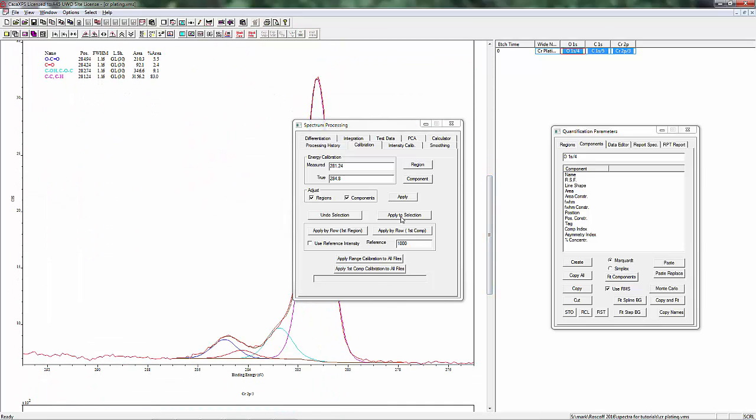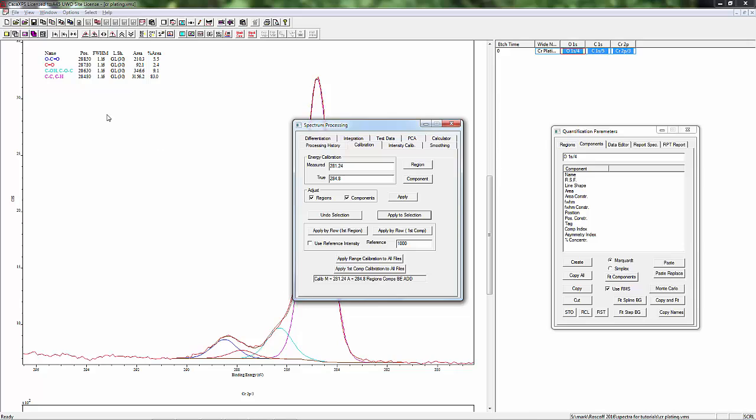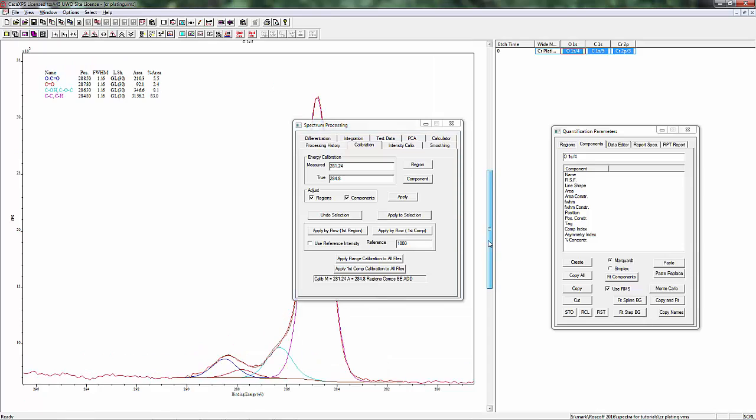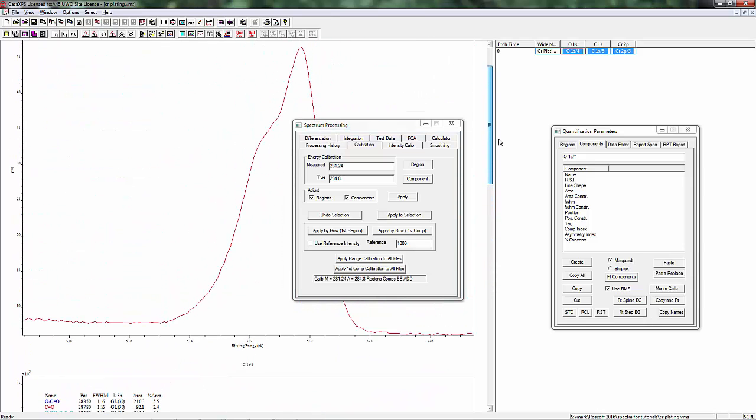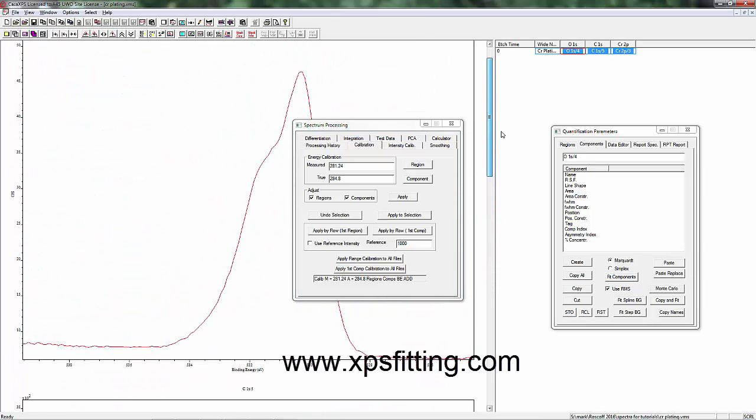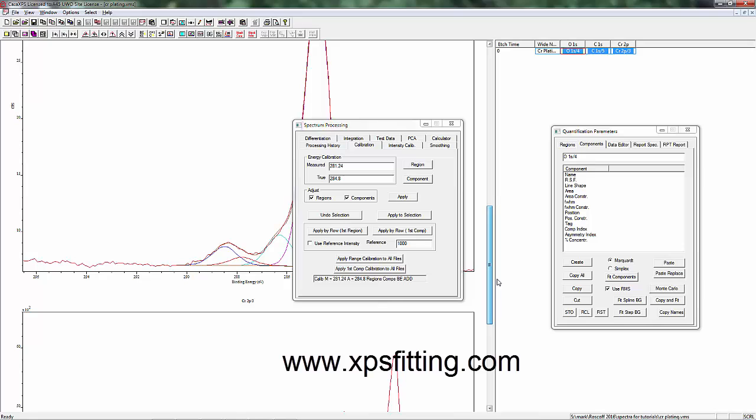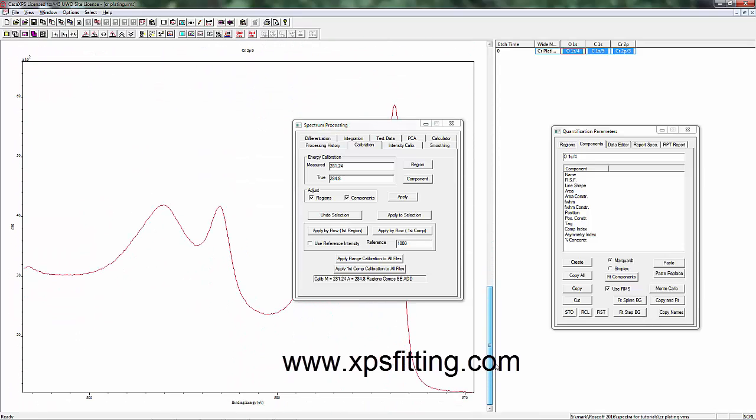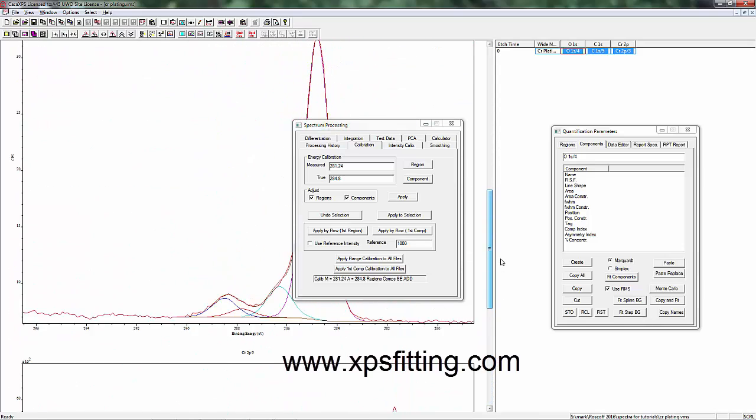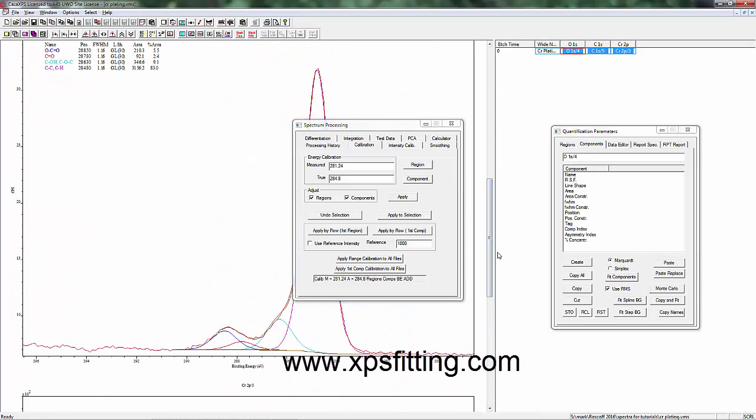And you can see now that the binding energy is shifted over. Our carbon peak main peak is at 284.8, and it's also shifted over for the other spectra. So the oxygen spectrum has been shifted over, and here the chromium spectrum has been shifted over. And that's it.